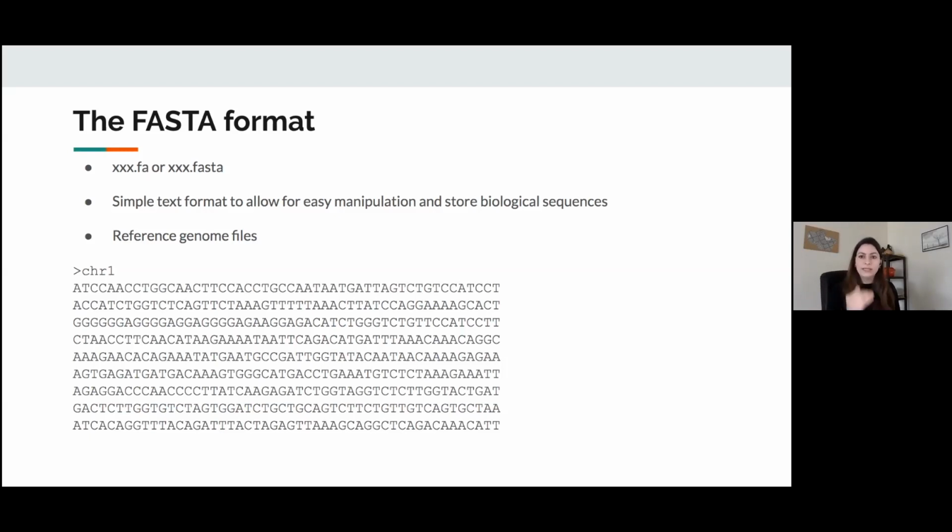It's only that you don't have two different sequences in the same file with the same name. And it doesn't need to have only the short name. It can contain a lot more information. In fact, some Fasta files used as input for a lot of software have strict formats of which kind of information you should have there and how it should be written.